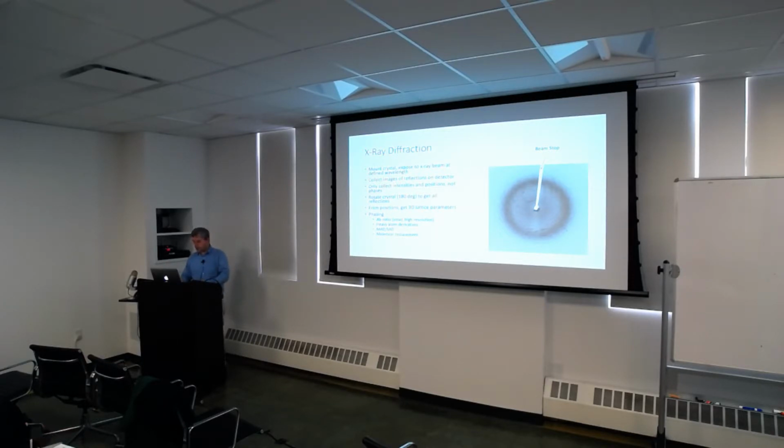There's also anomalous diffraction, through the MAD and SAD techniques, where you replace methionine with selenomethionine, and you then look at the diffraction, you change the wavelength a little bit, you see the anomalous diffraction from this selenium atom, and then you get phases that way.